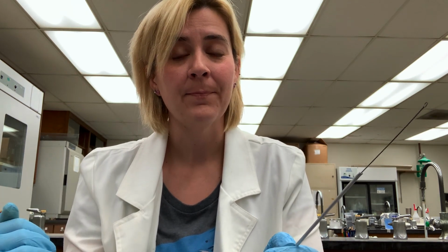So for a Gram stain, just like always, we'll grab our slide, we'll sterilize our loop, and I'm actually going to try a couple of different cultures on the same slide. Cells that I think should have differential Gram reactions. I'm going to do 1 Gram positive, 1 Gram negative, and 1 mixed culture. And this will allow me to determine whether or not my technique was good, because the Gram positive should be purple, our Gram negative should be pink, and our mixed culture should have a mixture of both.